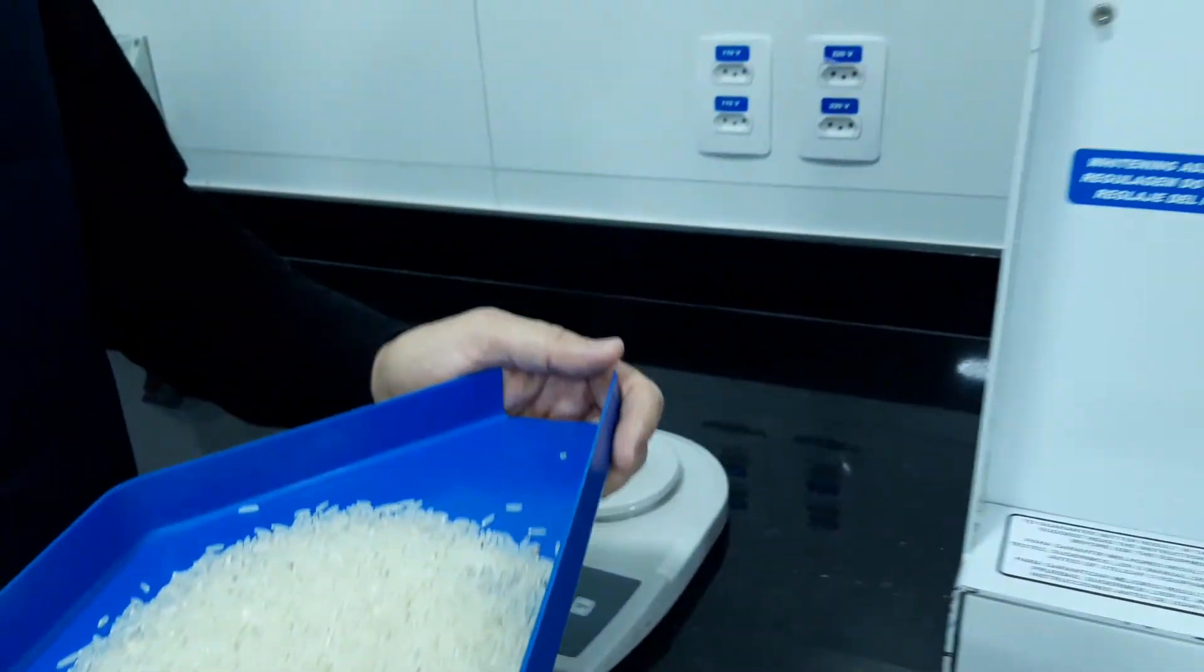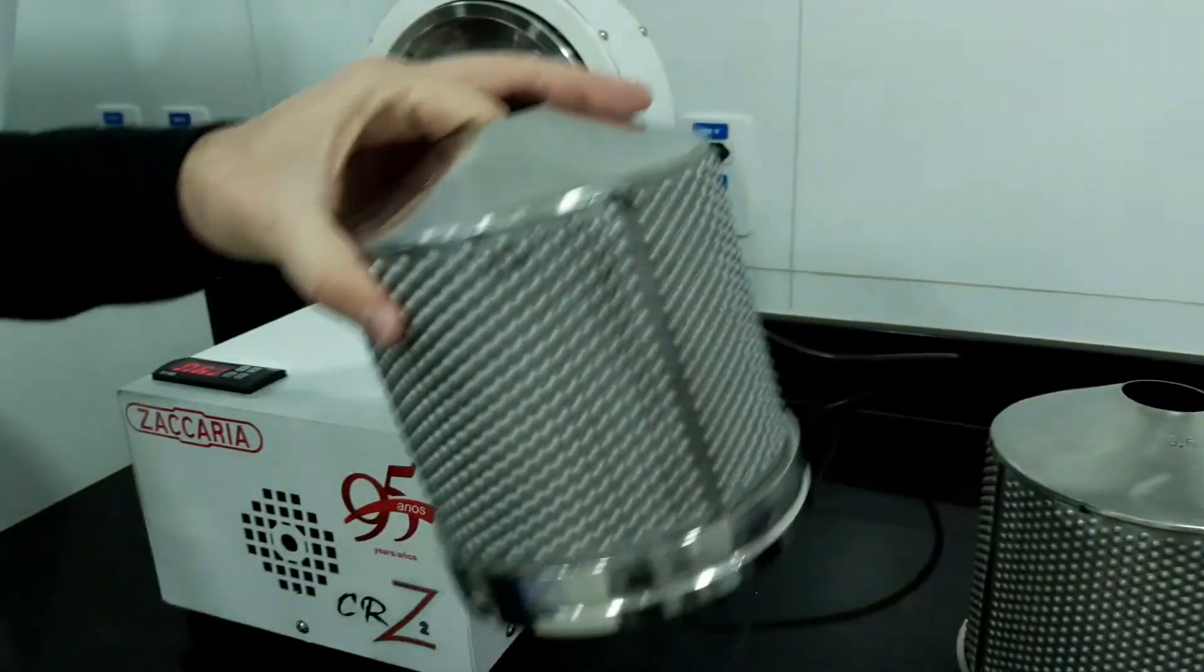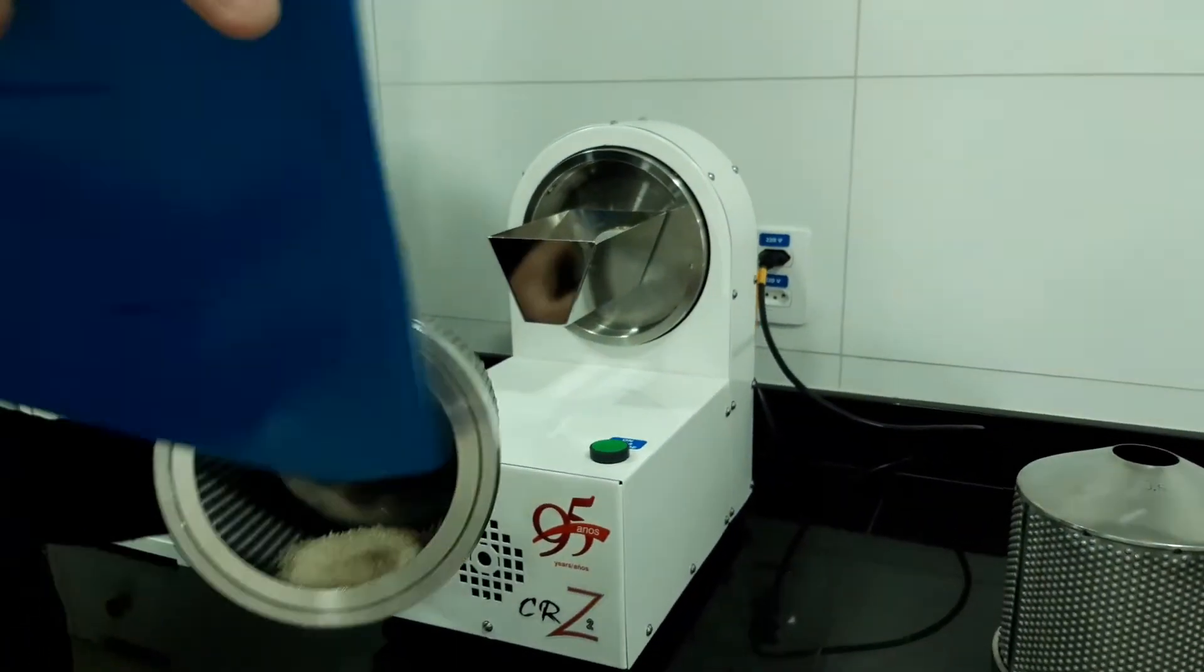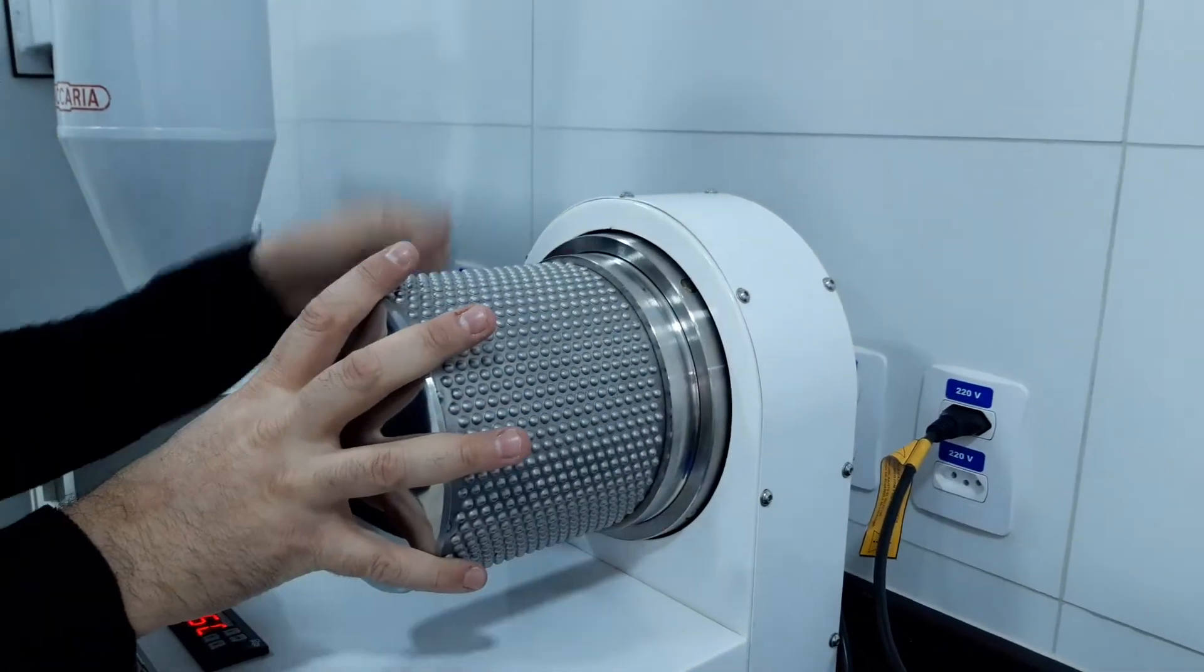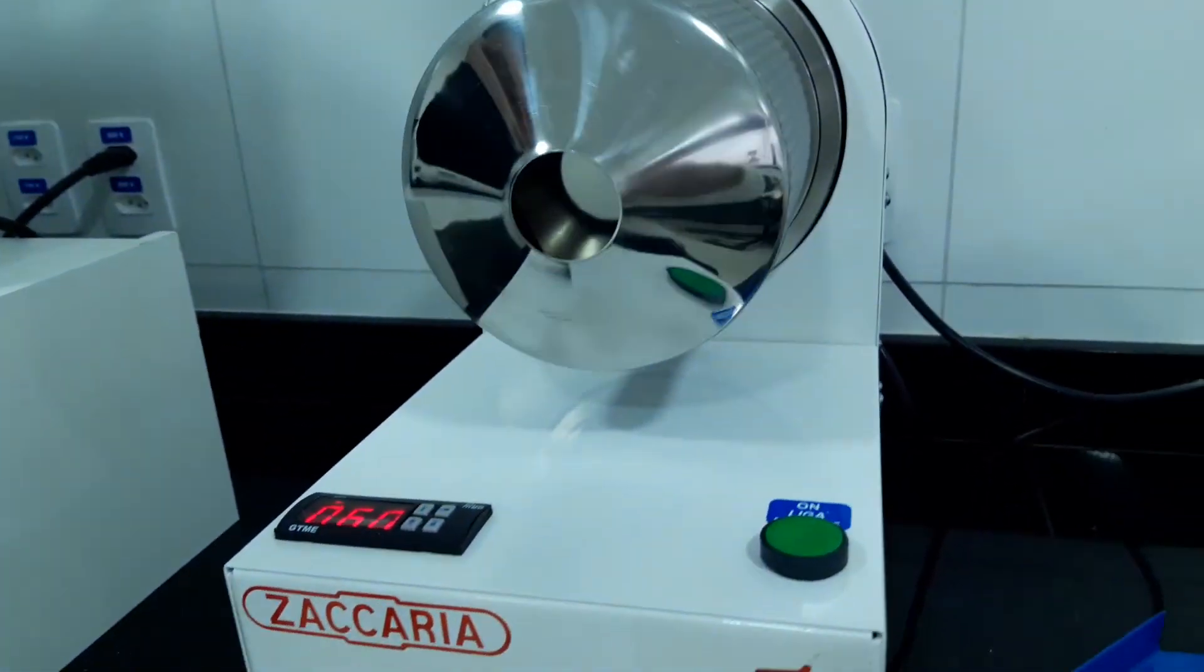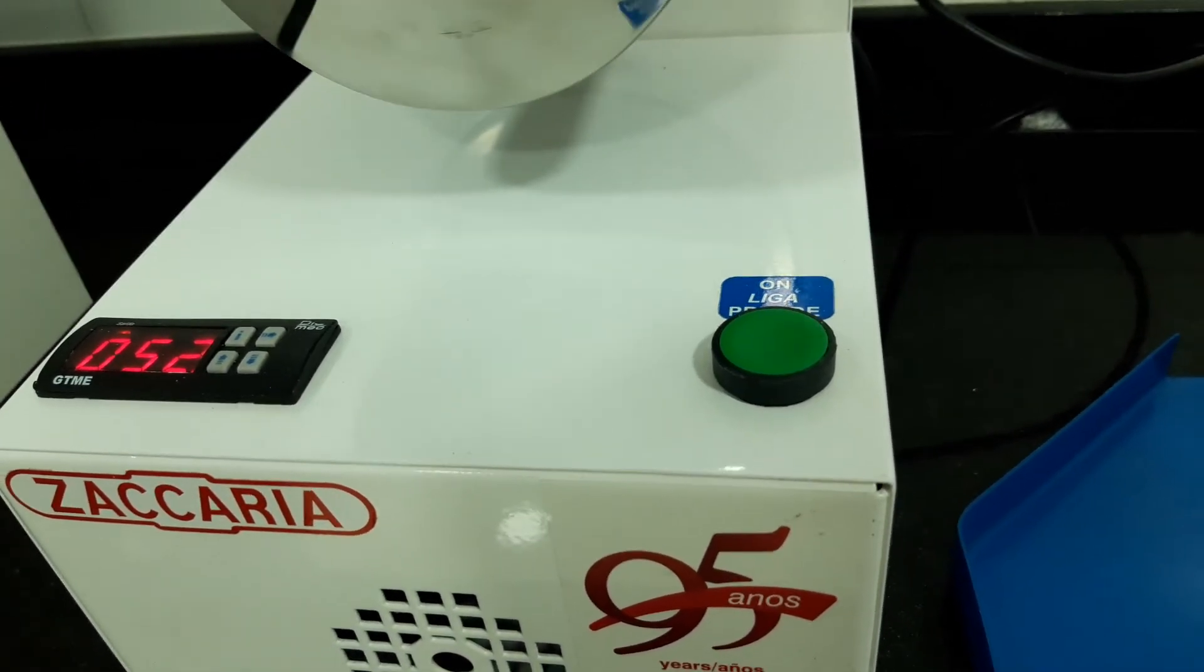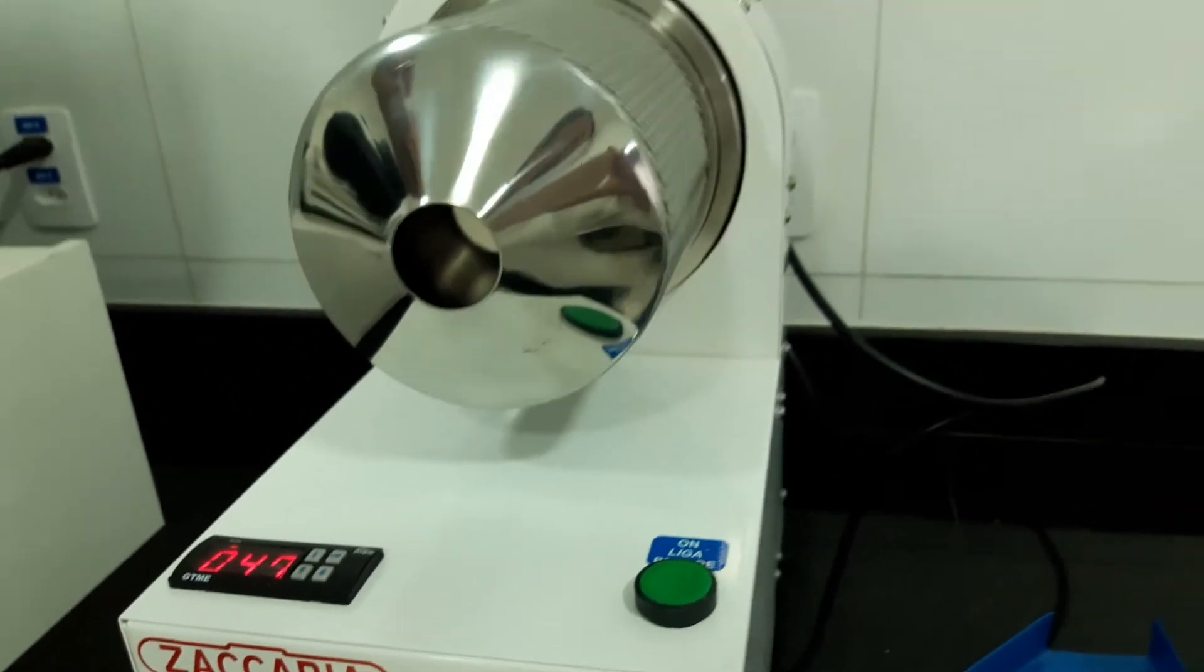And now we will measure the broken parts in the CRZ2, the length grader, with the cylinder of 4.5mm for the long range. We load the cylinder, connect the cylinder to the machine and it starts the classification. That is going to take 60 seconds to separate the broken rice from the whole grain.